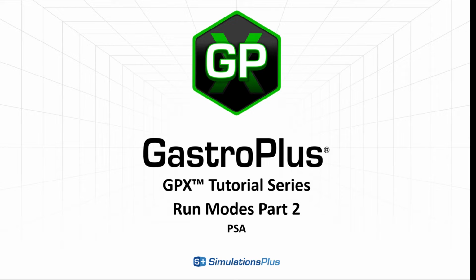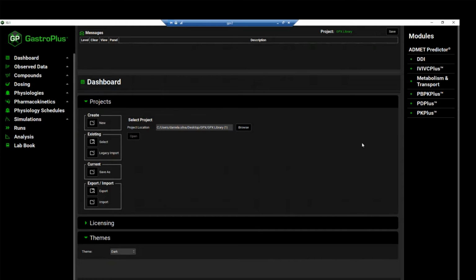Hello. In this video, we will cover the run modes in GPX using the GPX library project. To open this project, go to the dashboard view and click on the icon next to select to open an existing project. In this case, I already have the GPX library project opened, as you can see on the right-hand side of the GUI, where it displays the project name, and also you can see that all the views are enabled. Before we do our exercise, we will save a copy of this project.